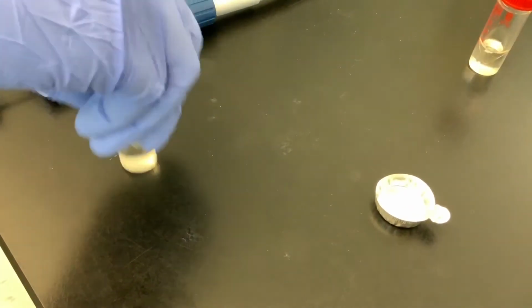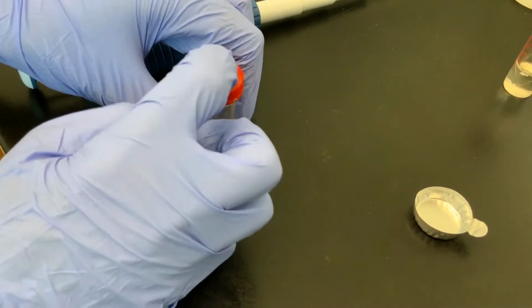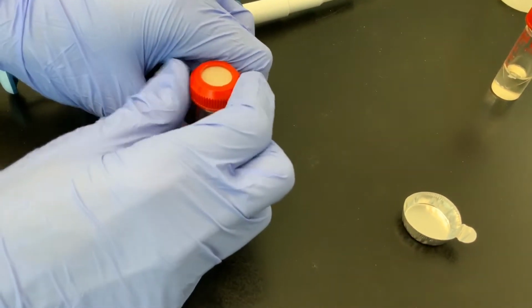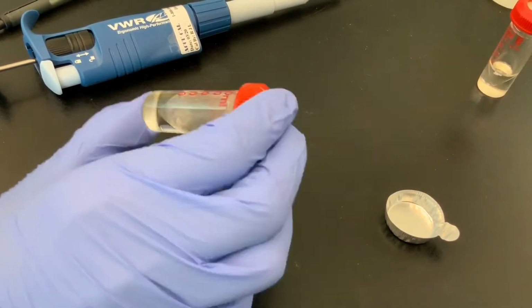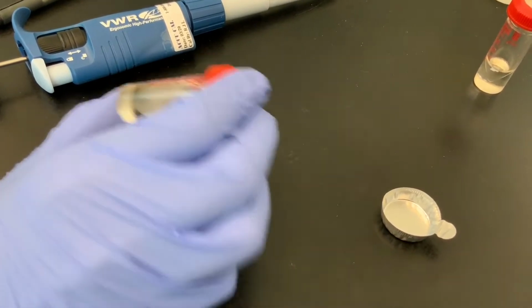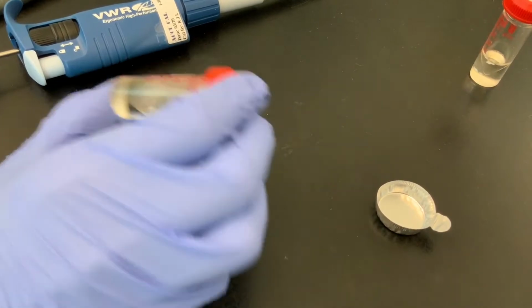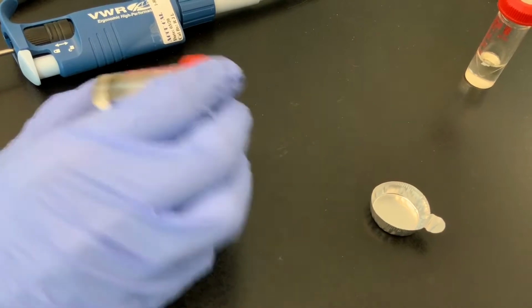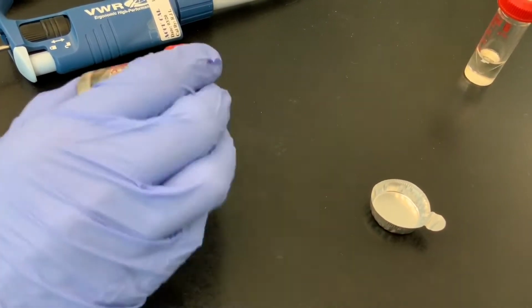And so now what I'm doing is that I'm stirring it again, and then also I'm going to be sure that my cap is very tightly sealed and that I've got a septum that has never been pierced before, so we've got a good seal here. And I'm going to just gently shake the reaction vial, and what's going on here is now the benzoic acid is going to distribute partially into the aqueous layer and then, of course, remain in the organic layer that we had originally dissolved it in.